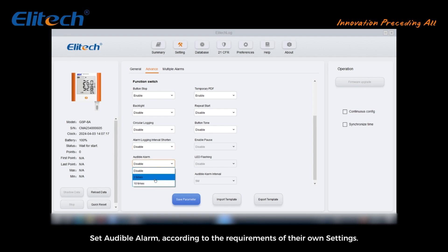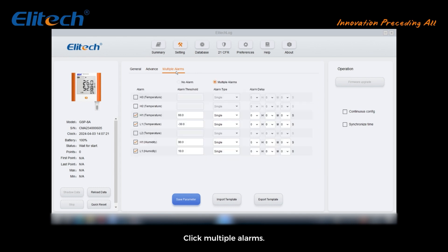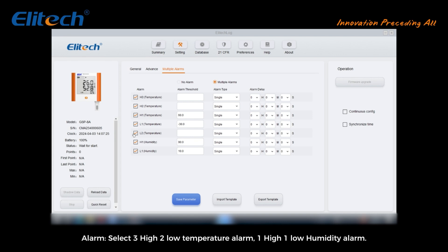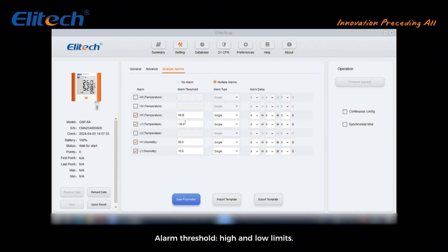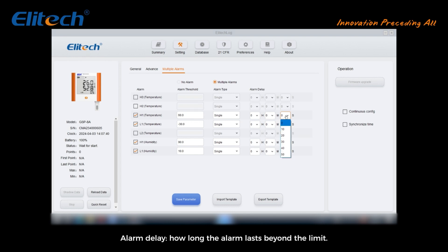Set audible alarm according to requirements. Click multiple alarms: alarm select three high, two low temperature alarm, one high, one low humidity alarm. Alarm threshold: high and low limits. Alarm type: single or cumulative. Alarm delay: how long the alarm lasts beyond the limit.